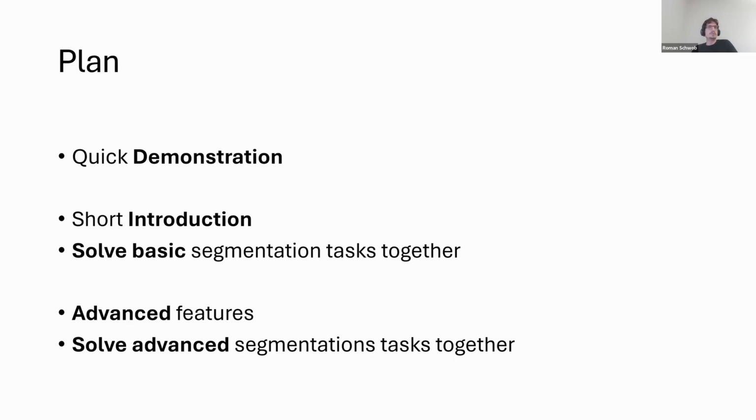I've tried to start on the basic level, because obviously I couldn't know exactly what the knowledge level of the audience would be, but I hope that along the workshop, we're going to get far enough so I can really show you some applicability of Convpaint in your work.